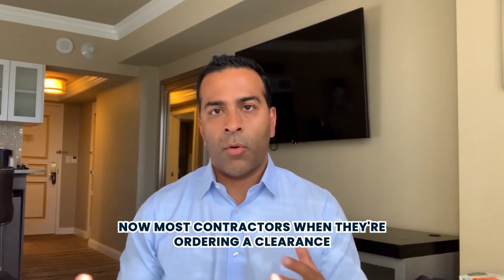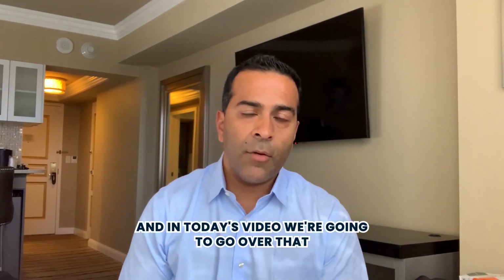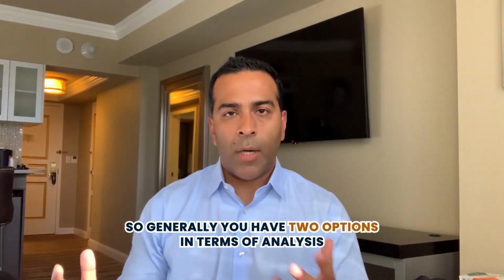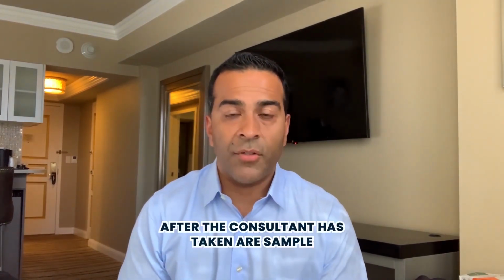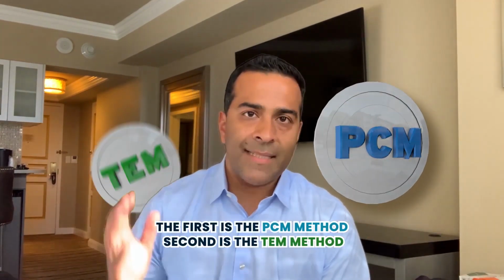Now, most contractors, when they're ordering a clearance, may not be aware of the intricacies between the options in terms of analysis, time frame, etc. And in today's video, we're going to go over that. So generally, you have two options in terms of analysis after the consultant has taken the air sample. The first is the PCM method. The second is the TEM method.